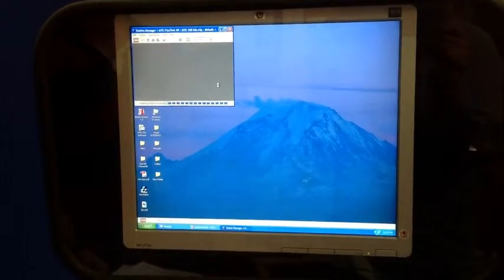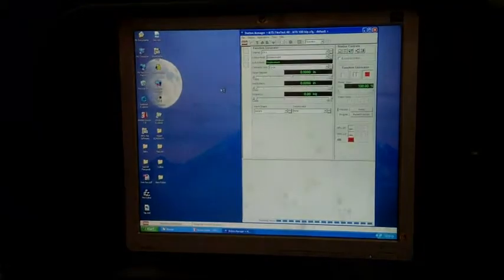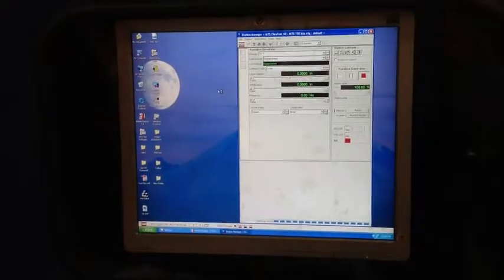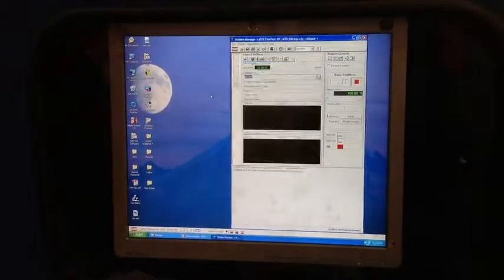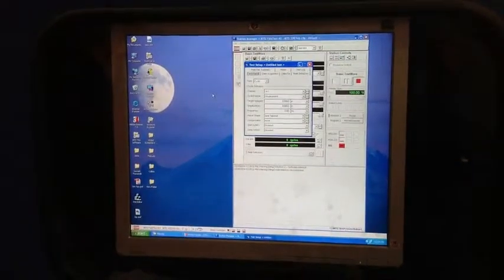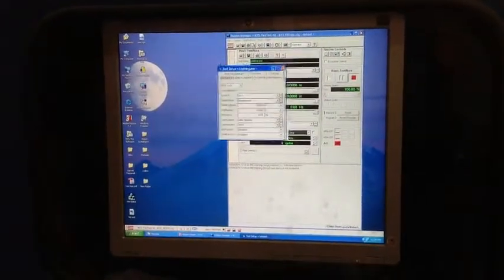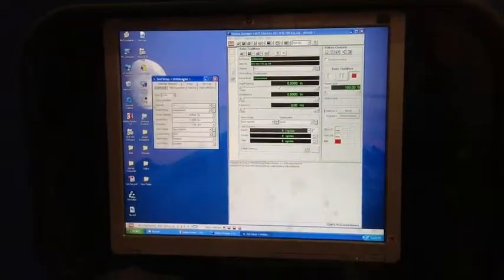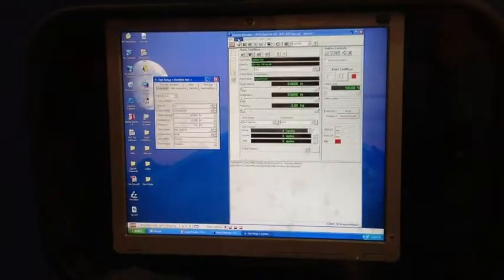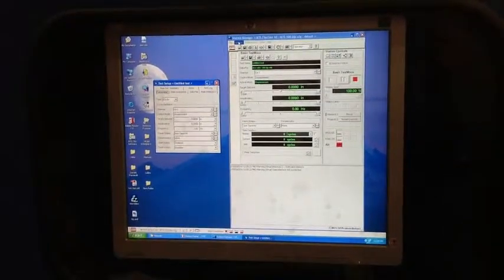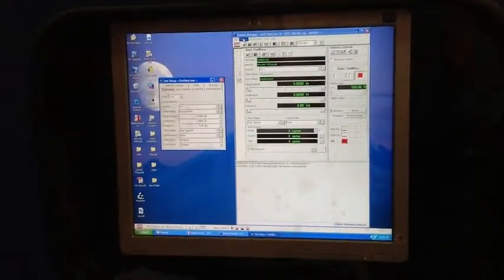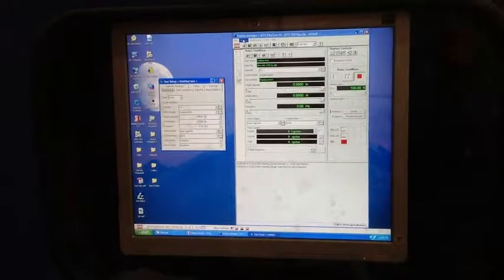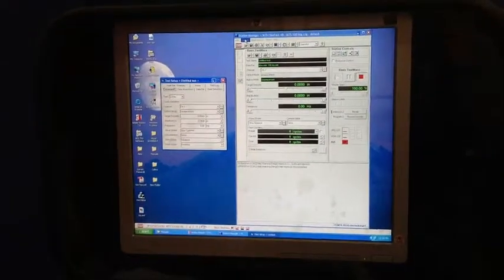So after a few seconds, there's going to be several windows pop up. I'm still waiting. Here we go. So before you change anything, you also need another two windows to ensure that you are doing everything correct.